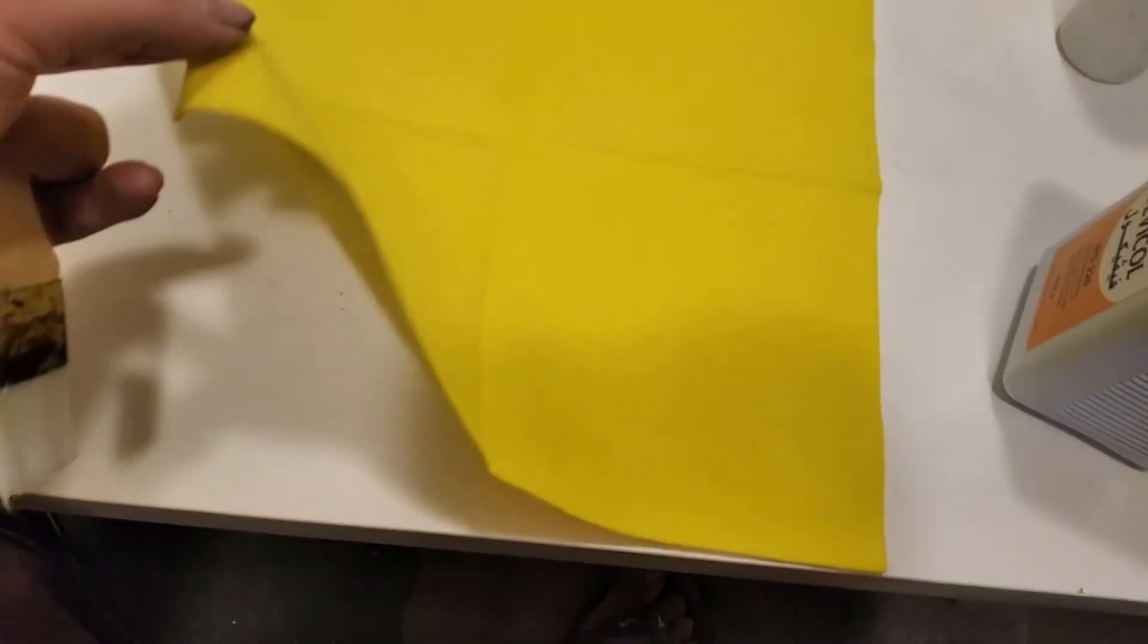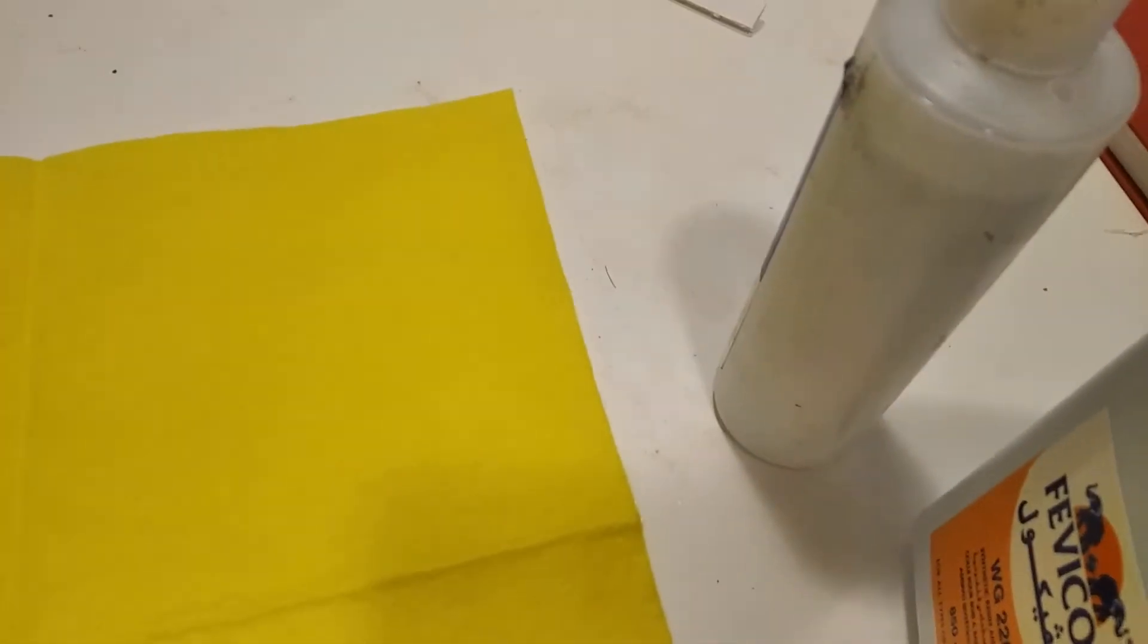We have here some cleaning cloth. It can be paper, but cleaning cloth is better. Synthetic fabric would be the best. We have over here some PVA glue, and we have our sodium borate.